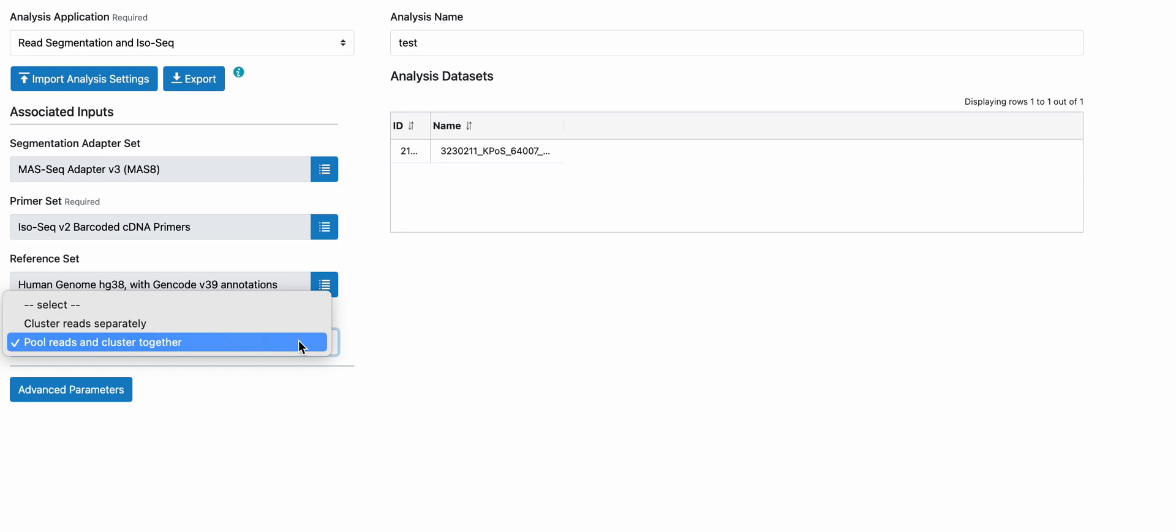If you select by default pool reads and cluster together, it means after identifying the full-length reads and the barcodes associated with each cDNA primer, all of the reads will be pooled together for isoform clustering, mapping, collapse, and classification against the annotation.